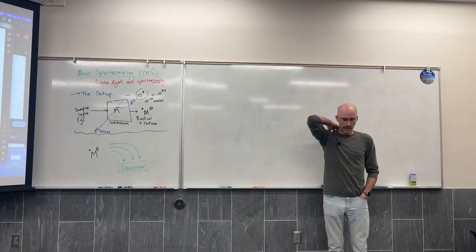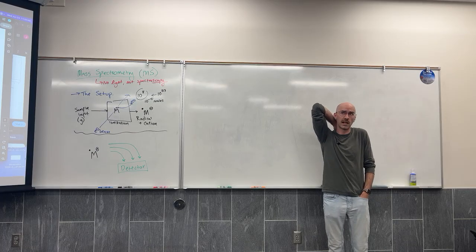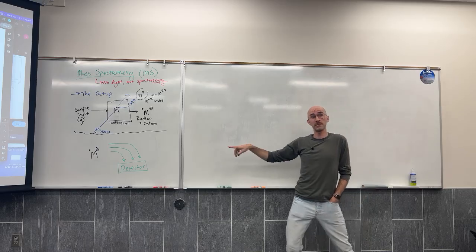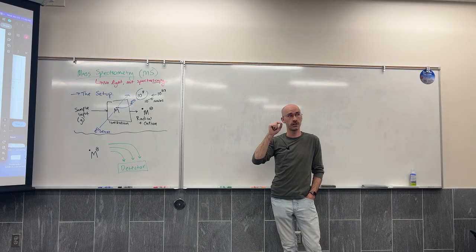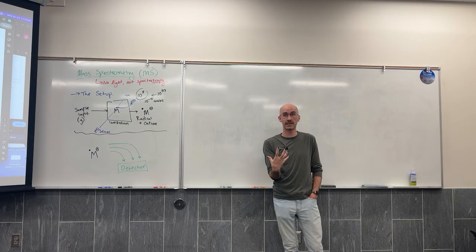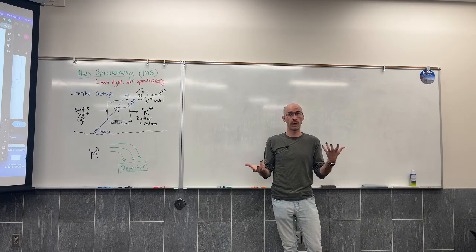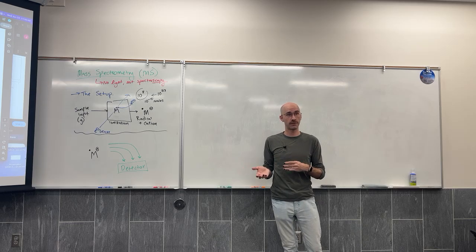I'm always trying to improve my analogy here, so I'm going to try for one. This magnetic field interacts with the charged particle, the molecule that now has the cation, because magnetic fields interact with charged particles. So I can make this charged particle change its behavior in a magnetic field.